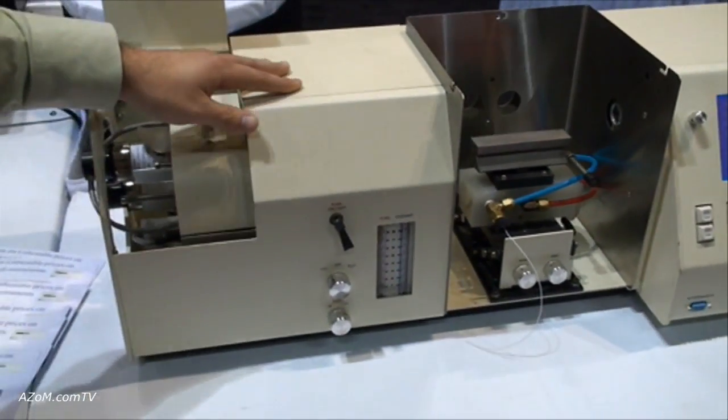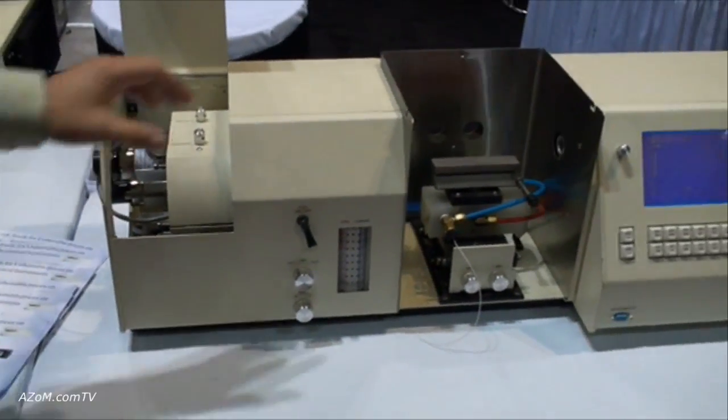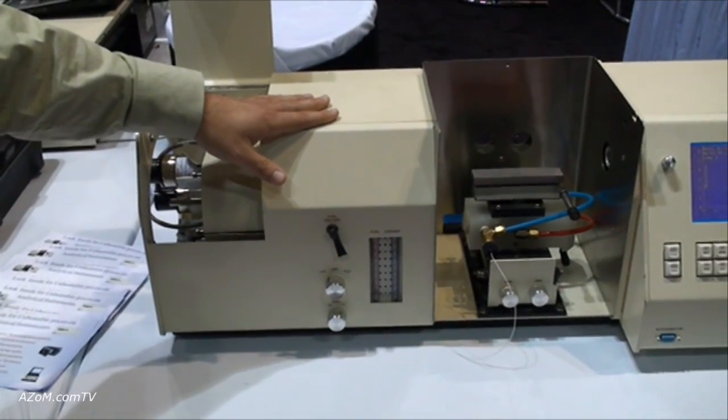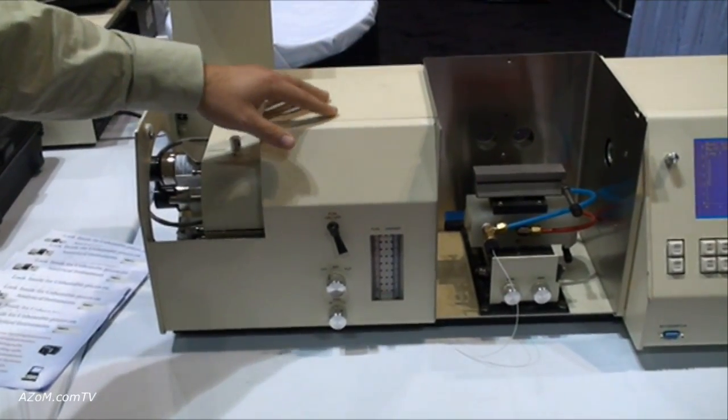This particular model has deuterium background correction, so samples with organics in the matrix can still be analyzed.